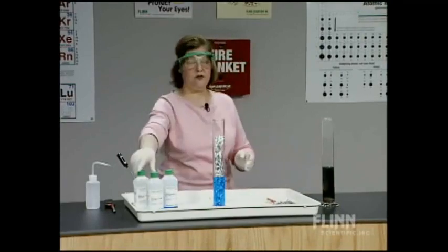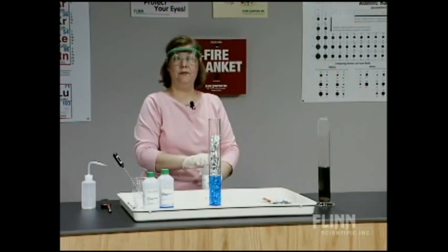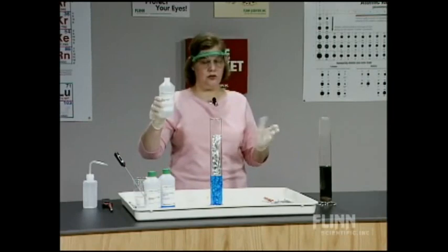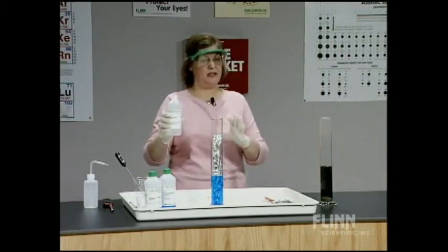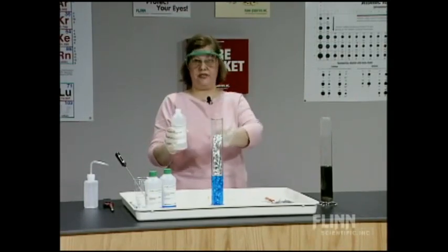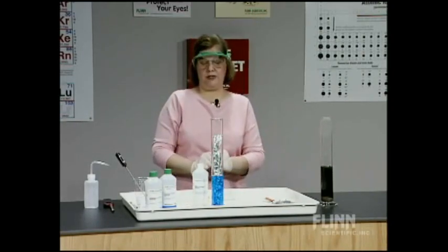Even though it appears that the chloride ions are not involved in the reaction, you in fact need the chloride ions. So what I'm going to do is add some sodium chloride, and I'm going to fill it about half full, and then I'm going to try to mix them in here. And the nice thing about using a hydrometer cylinder in a classroom demonstration is it's really visible. It gives you that height. It's not just something that's small on the bottom of the bench there.